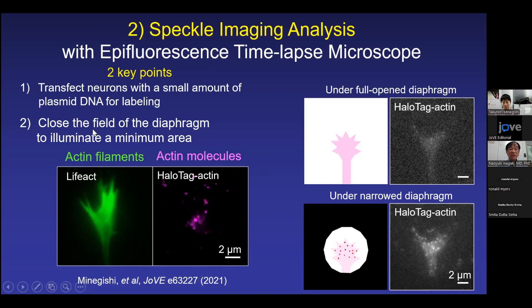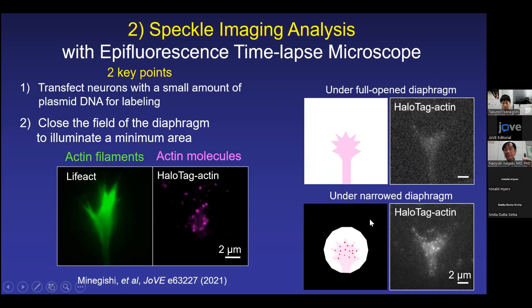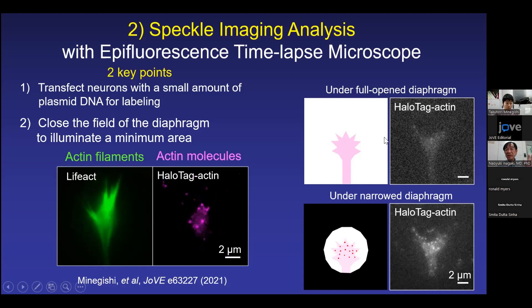The second key point is to close the field diaphragm of the microscope to illuminate a minimum area, because the signals of a single molecule are very weak. When the diaphragm is fully open, we cannot see the signal. But when the area diaphragm is appropriately narrowed down, the basal signal is diminished and speckles of a single molecule appear. This is similar to observation of stars in the sky: when city light is bright, we cannot see dim stars, but when the city light is turned down, we can see many stars clearly.